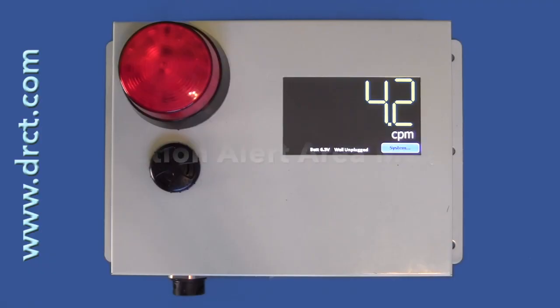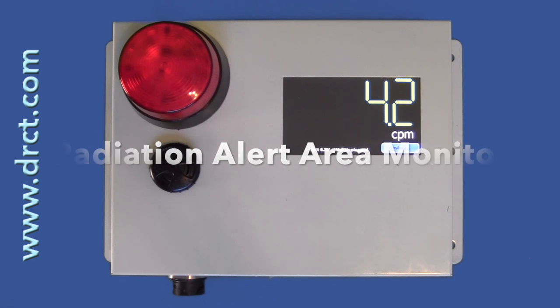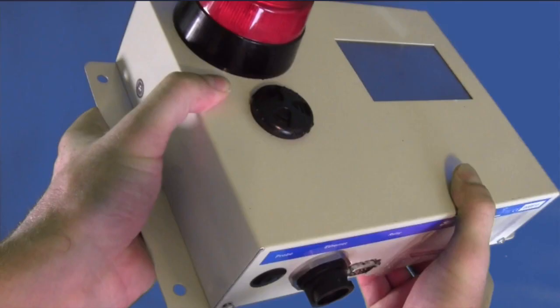This is a demonstration of the Radiation Alert Area Monitor. Different types of detectors are available, internal and external, both scintillation and Geiger-Müller. The unit features an easy-mount steel enclosure of compact size.